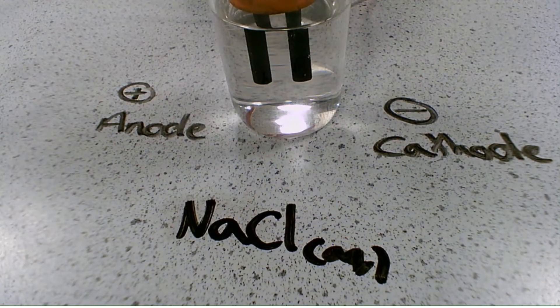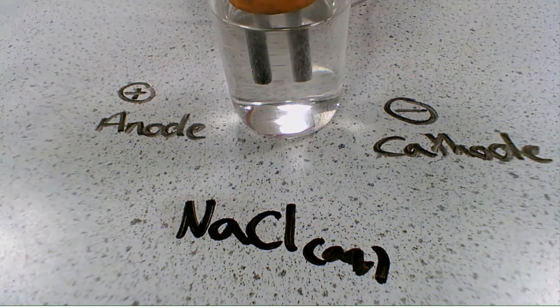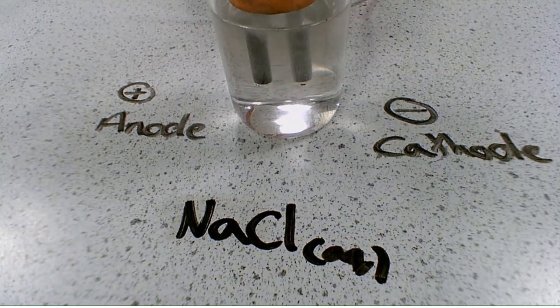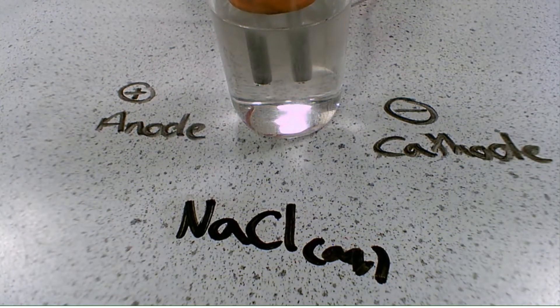The first electrolyte is sodium chloride — importantly it's aqueous. When we turn on the power supply, at the cathode we have bubbles of gas being produced, and at the anode we also have bubbles of gas. Because it's aqueous sodium chloride, in the electrolyte we have sodium ions Na⁺ and chloride ions Cl⁻, but we also have H⁺ and OH⁻ from the water. At the cathode there are two possible products: Na⁺ or H⁺.